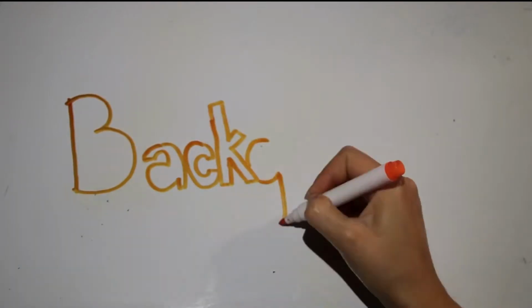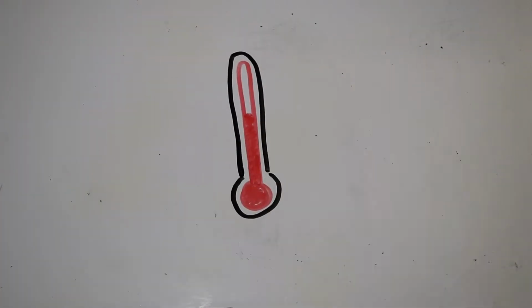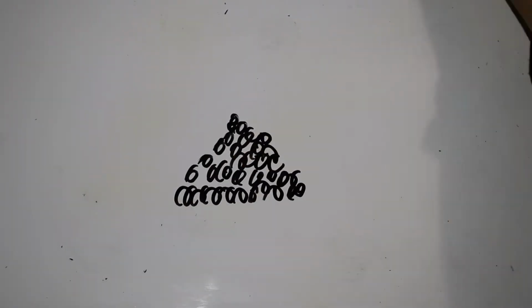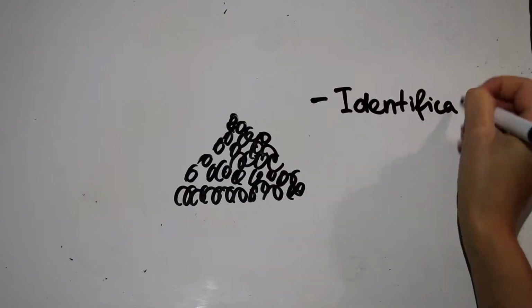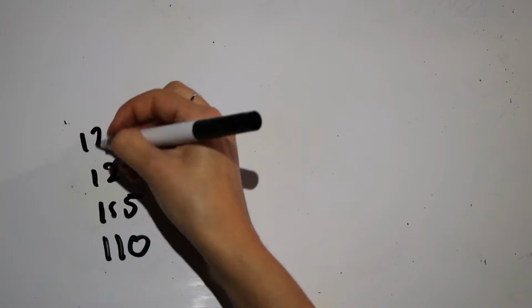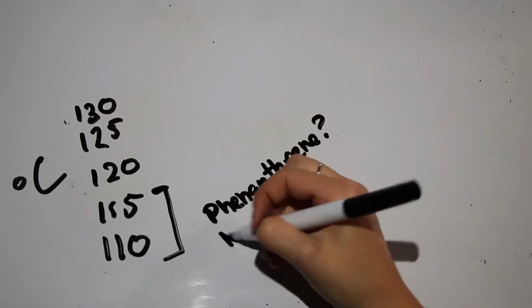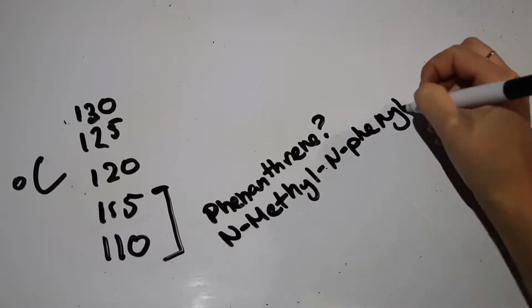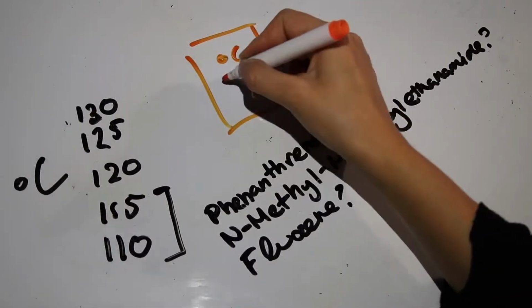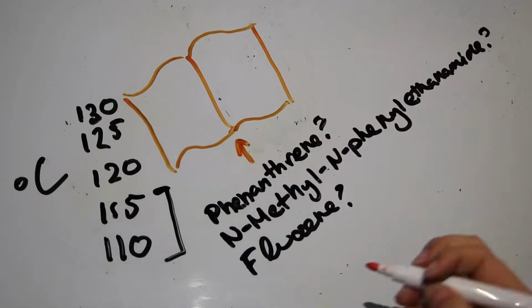The melting point is the most widely used physical constant for solids, and there are several reasons for determining a compound's melting point. It is useful in consolidating the identification of a compound, as well as helping to form a guide as to the relative purity of the sample. Due to being a physical constant, substances can be roughly identified using their melting point range. If you find out the melting point of a mysterious substance, you can compare this value to the literature melting point in a reference book to find which substance corresponds to your experimental value.